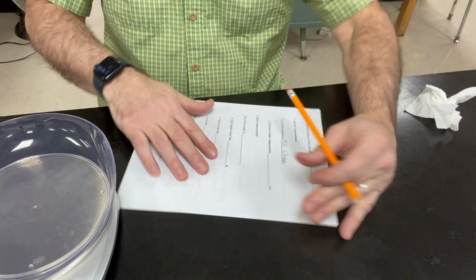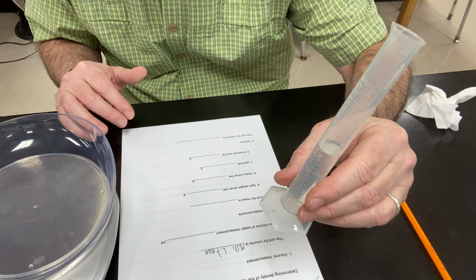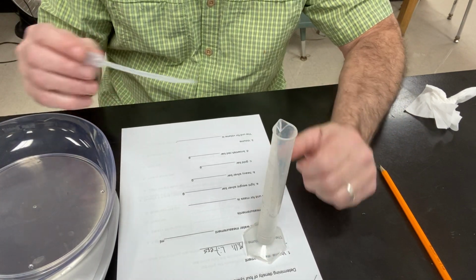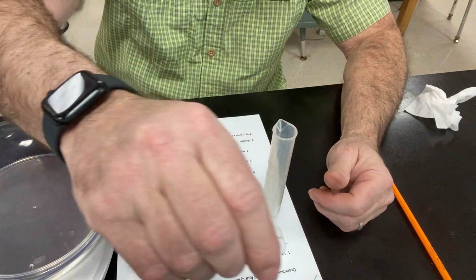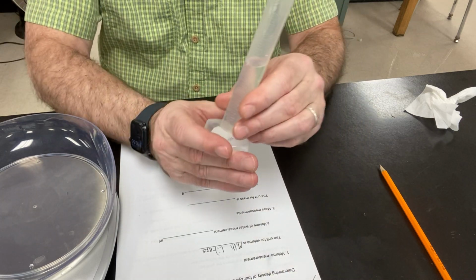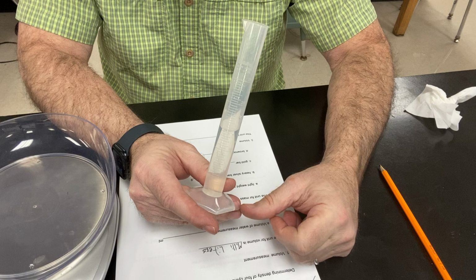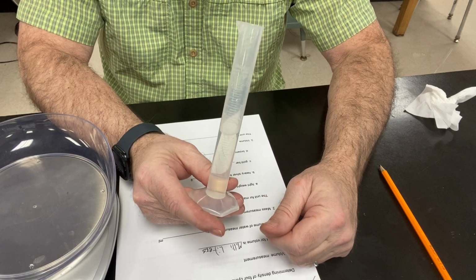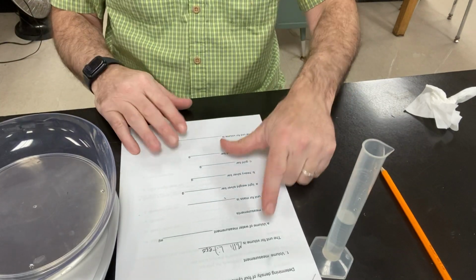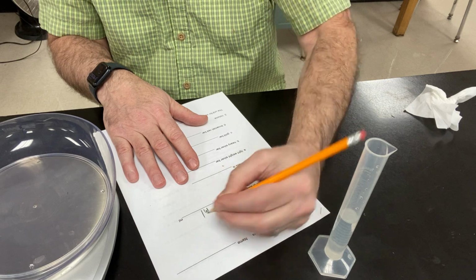Okay. And then the volume of water measurement, what I did earlier was I placed 15 milliliters of water in here, and I used a dropper to get it exactly. I put a little bit too much in, so I pulled it in there, pulled it out, put it back into the cup, and I got it pretty close to exactly 15 milliliters. One thing about this cylinder is that it goes by 1/2 milliliter. Each line is a half. Some people thought it was 1, but it's a half. Okay, so there's that. And the volume of water measurement, we'll put that there, 15 milliliters.